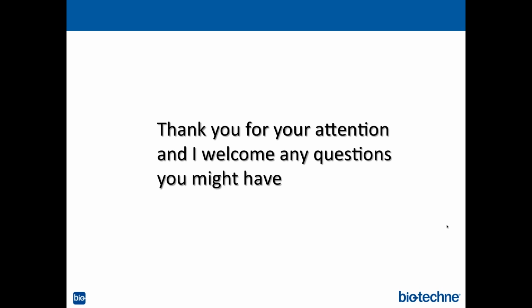Okay, so yes, glycosylation is definitely important for antibodies. I would agree with that statement. At the same time, I have to say we haven't done a study to analyze the glycosylation patterns in detail. We have decided to stay with one cell line expression system for that reason, the assumption being that it's going to be at least reproducible within one system.